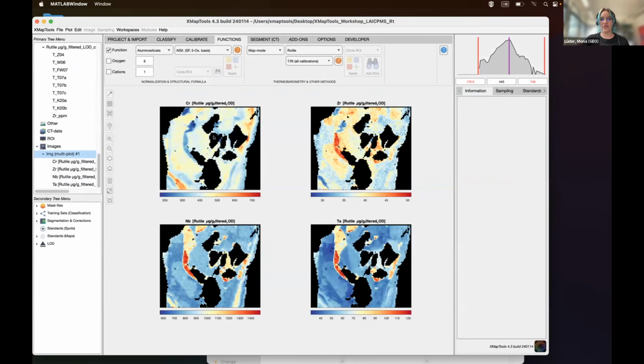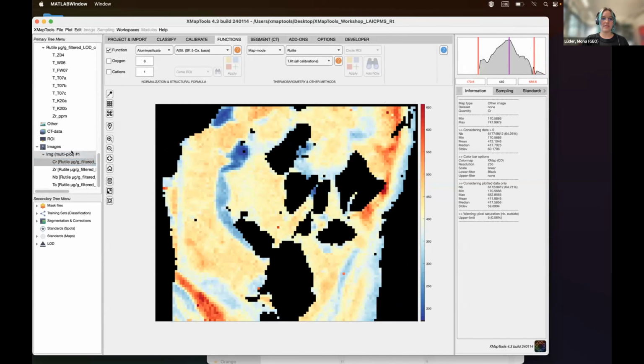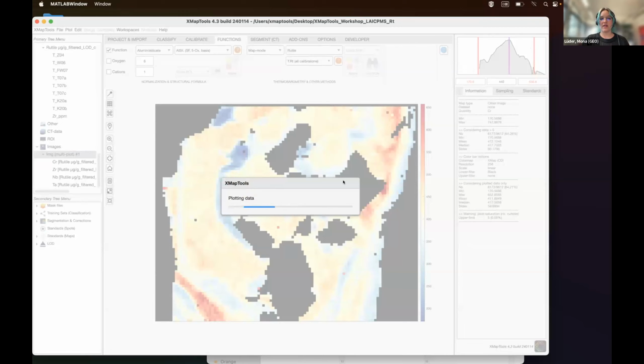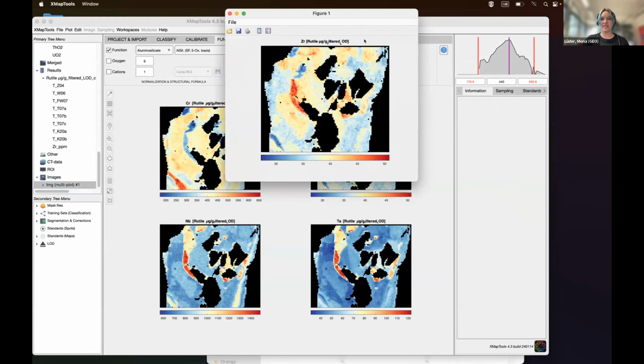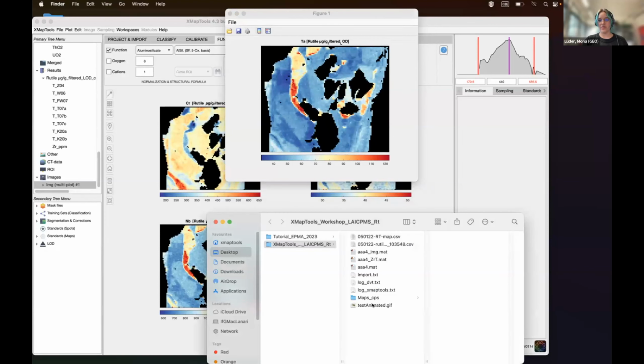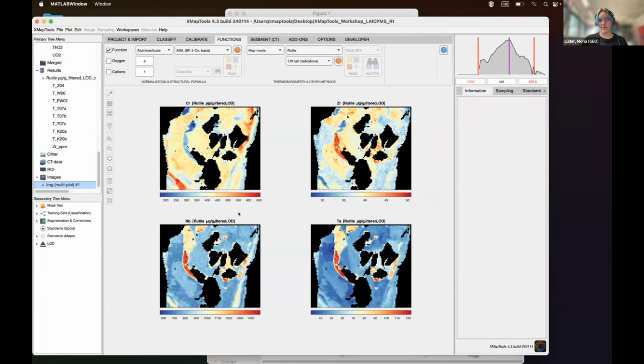And we can first see all of the individual maps together, and we can have a look in more detail into the single maps, adjust, for example, the upper and lower limits of the color bar, and then go back to seeing all maps combined, and it saved the settings that we set. Now, if we go on this image with right-click, Save as GIF, it will automatically create the GIF, and it will automatically be saved in your working directory. And this is, for example, a very nice feature for looking at garnet rare earth element compositions. And with that, I give it back to you, Pierre.